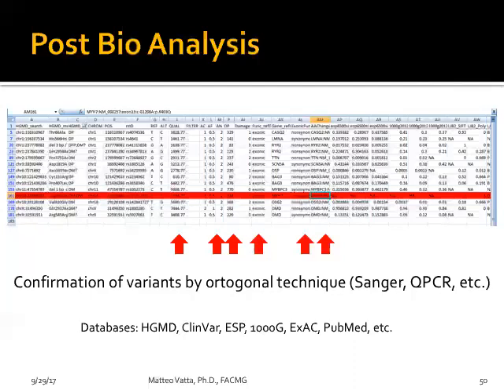When we detect the variant, it is also important, in order to provide the classification, to determine if this variant is present in the general population. There have been many databases historically: dbSNP, the 1000 Genomes Project, the ESP database, then the ExAC database, and now the gnomAD database, which includes not only exome sequencing, but also 15,000 genome sequences from the general population.